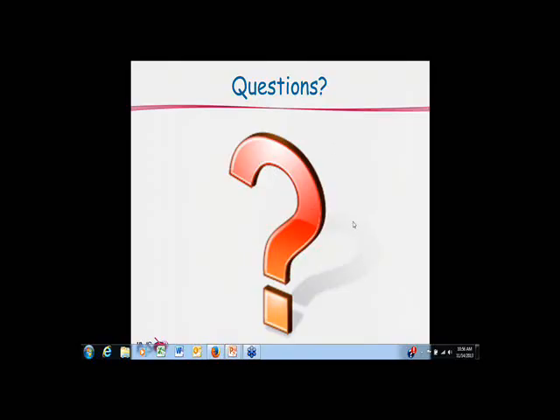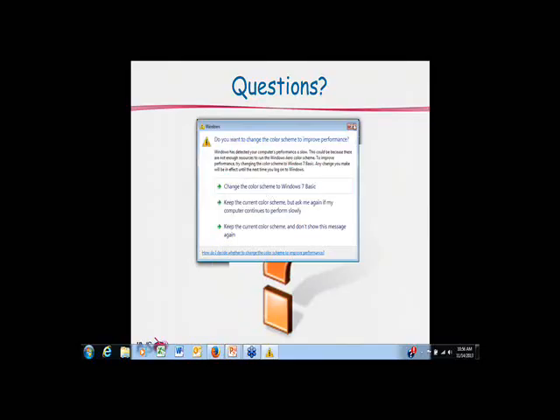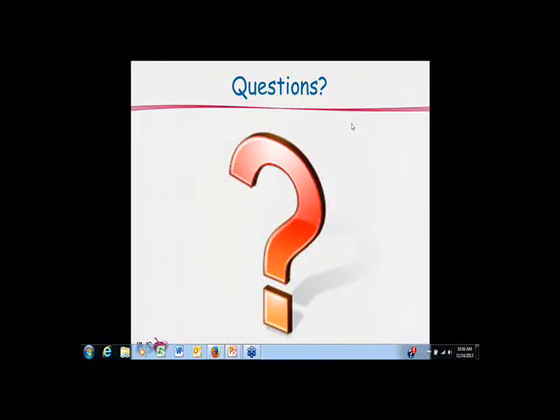No, so this is Susanna. So we also use flow cytometry, and that's also the assay that's in preparation of an OECD guideline. And CD86 and CD54 are both cell surface markers, so they're basically proteins. So it should probably be possible to also detect them by ELISA. But I would consider this as a significant change to the method, and hence this would not be part of the OECD guideline that is currently being drafted. If it would be as simple, I think somebody would have tried, but maybe just nobody has tried. That's always possible.